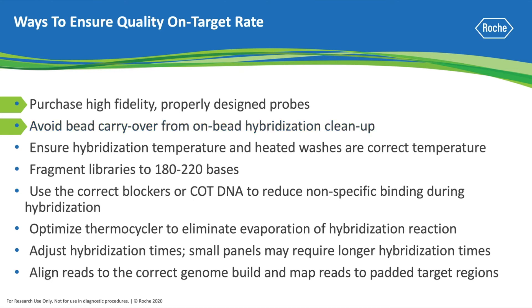The temperature of the hybridization and wash steps are critical to the success of target enrichment sequencing workflows. Therefore, ensure that the hybridization and wash steps are carried out at the correct temperatures. Data analysis methods can also affect on-target rates. Much like designing probes to the correct genome build, aligning sequencing reads to the correct genome build is critical for maintaining on-target rates. Additionally, on-target rates can be improved by adding padded regions to the ends of target regions to ensure flanking on-target mapped reads are included.